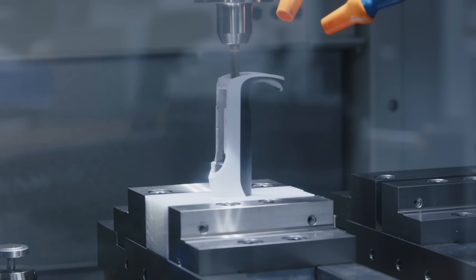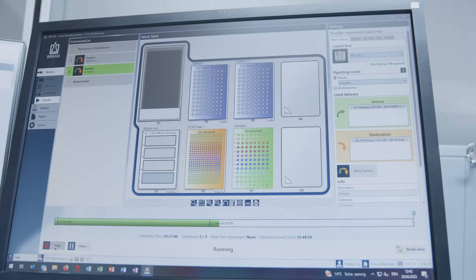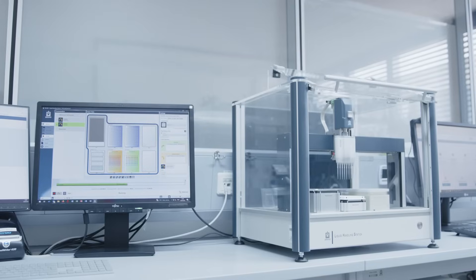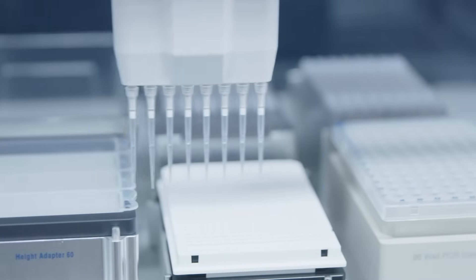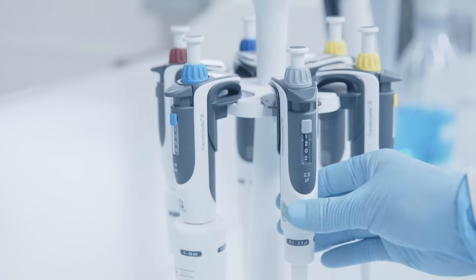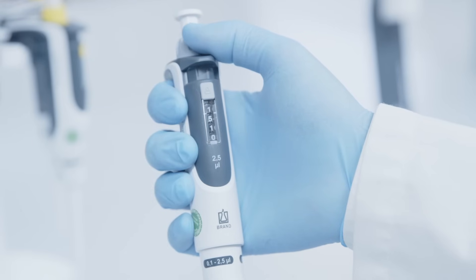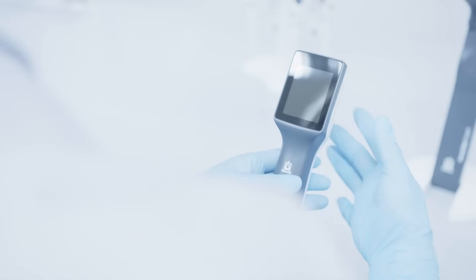The right way to more efficiency can be as diverse as lab work itself: automating routine tasks or making manual liquid handling more ergonomic. All our solutions have one thing in common - they are developed by lab professionals for lab professionals.